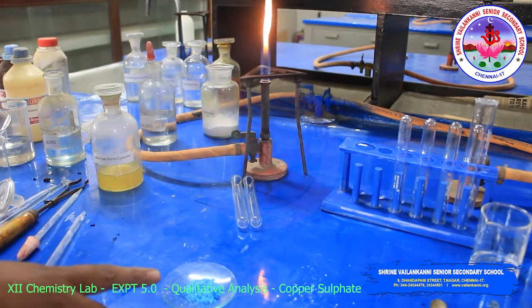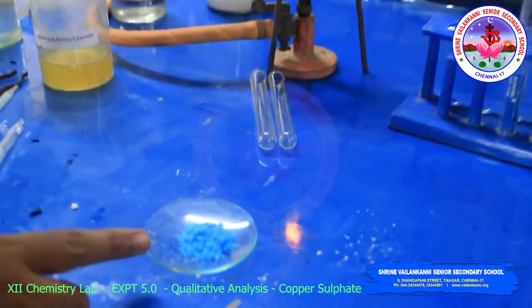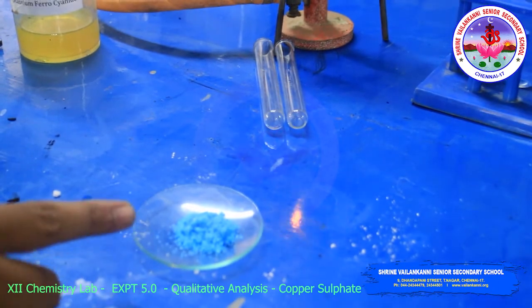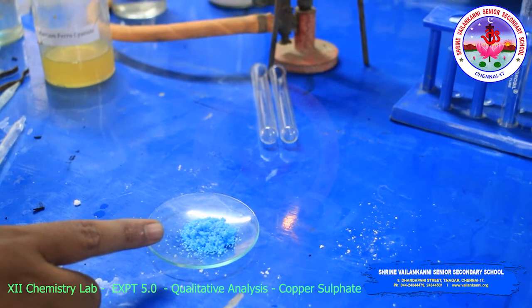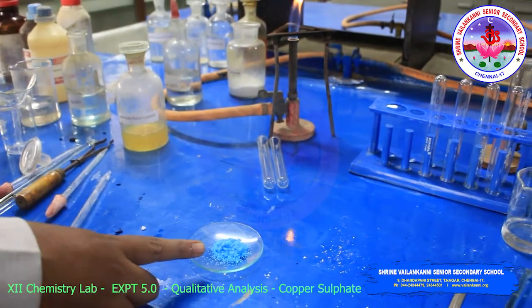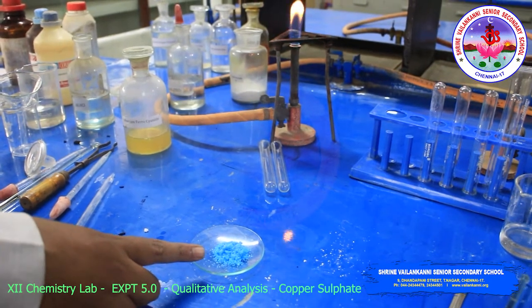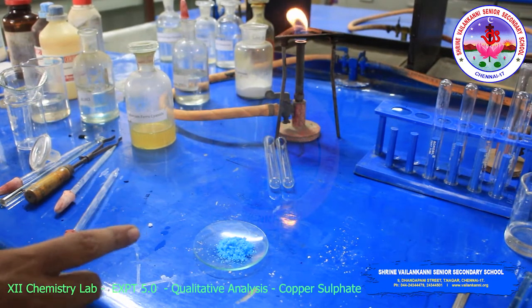The next substance is copper sulfate. Here the basic radical is copper and the acidic radical is sulfate. Now we will do the sulfate test. Before that, you have to prepare the sodium carbonate extract. I will prepare the sodium carbonate extract now.